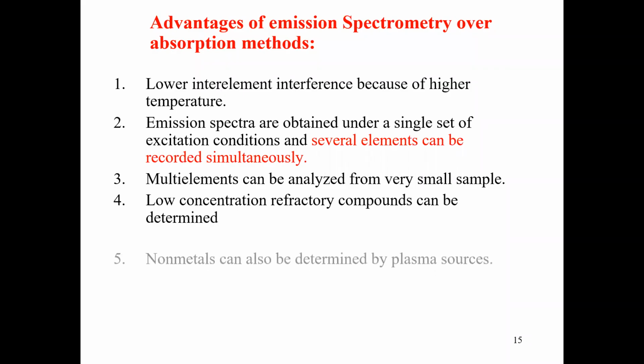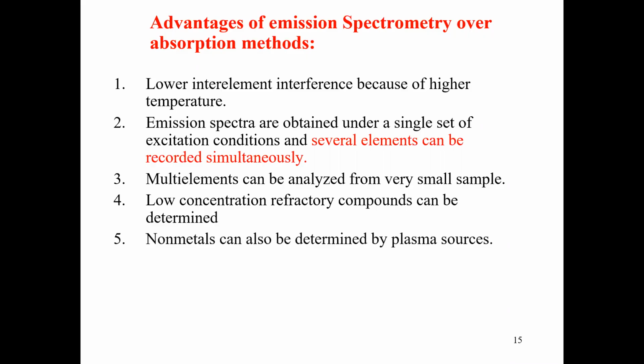So you can see those advantages. You can see another advantage. Non-metals can be determined by plasma sources. You see that? We can analyze both metals and non-metals at the same time.